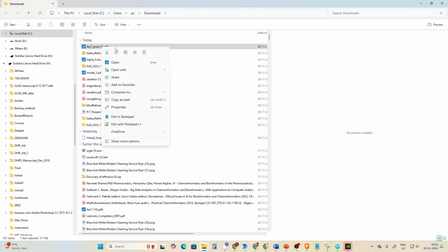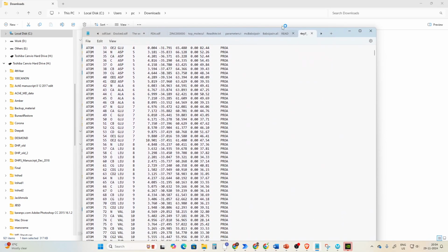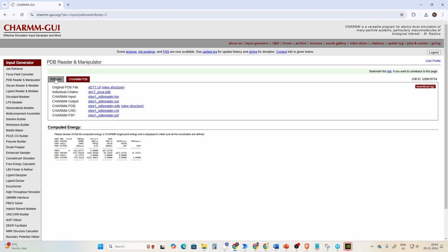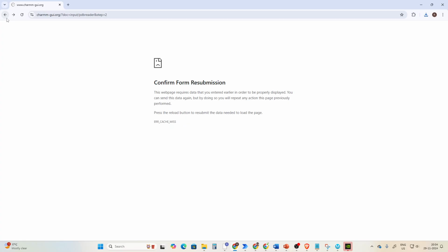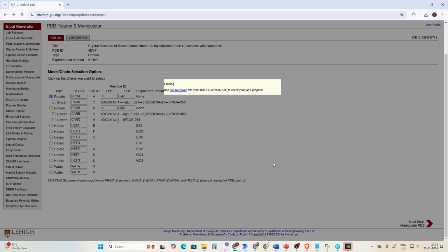So let me check. Otherwise I can just open the structure.